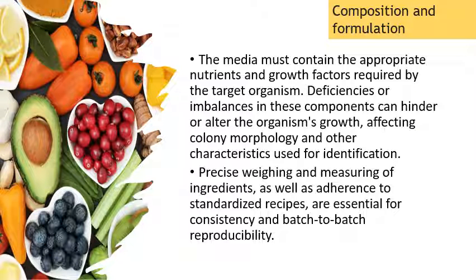Then the composition and formulation. Every microbiological culture medium is made of tailored constituents or ingredients that have nutritive value, and solidifying agents plus selective elements, which are designed to give the microbial cells a feel of their natural environment, to mimic their growth requirements for specific microorganisms during isolation, identification, and study.